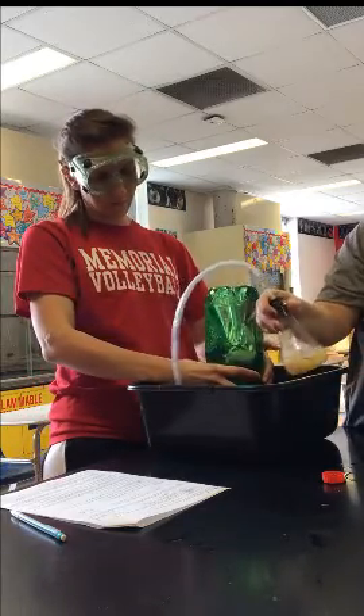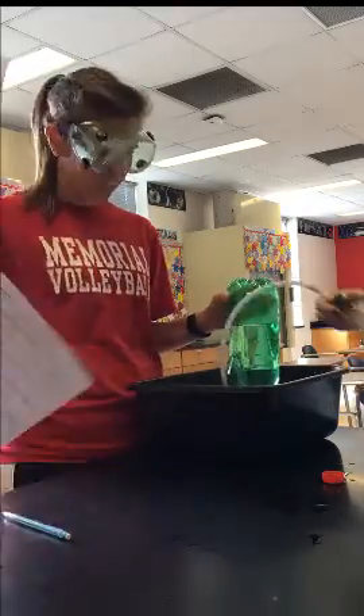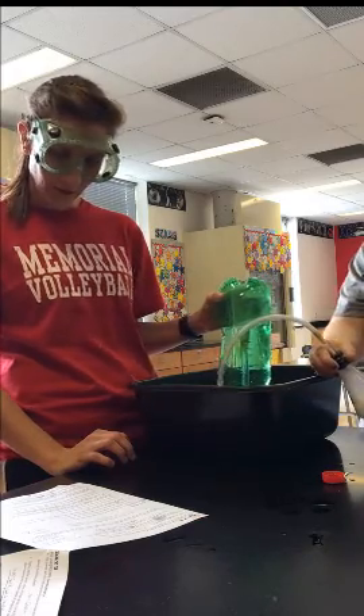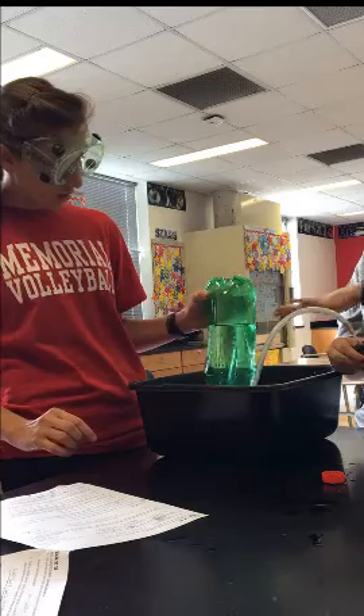You should see some bubbles starting to form — you can see the oxygen gas forming in the bottle. Continue collecting oxygen gas until you have no more bubbles coming out, meaning the reaction has stopped. Notice you'll have about a third of the bottle filled with oxygen gas.